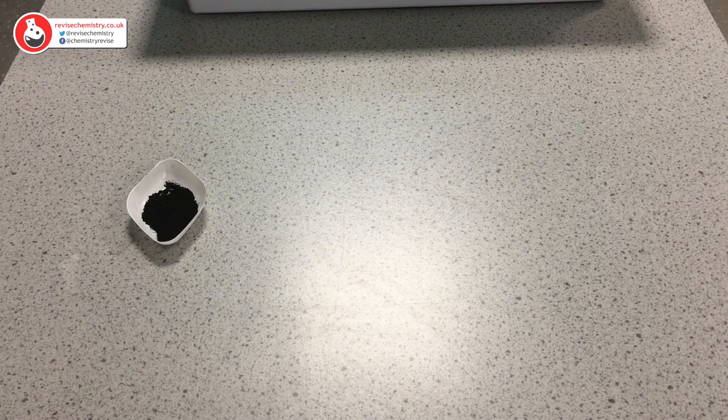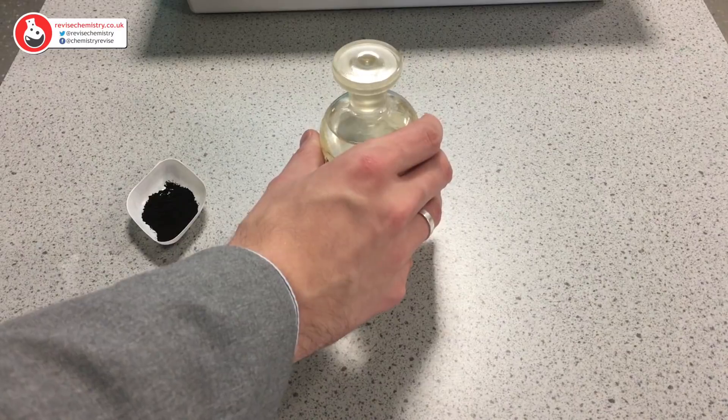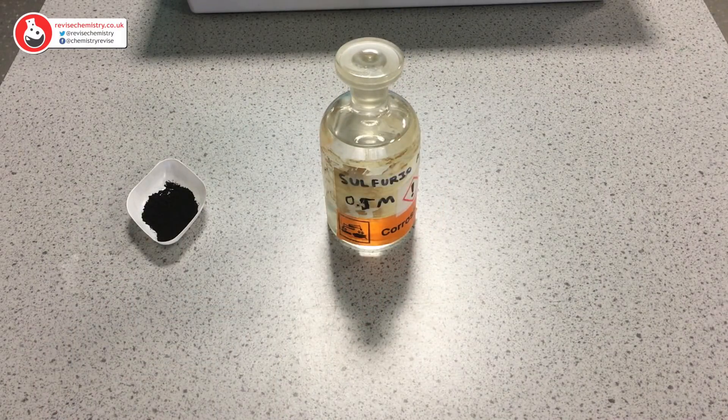To make copper sulphate we are going to need some copper oxide. Copper oxide is a black powder and it does not dissolve in water, which means that it is insoluble. We are going to react our copper oxide with some sulphuric acid. We need to be careful because sulphuric acid is corrosive, however the concentration we're going to be using should be okay.